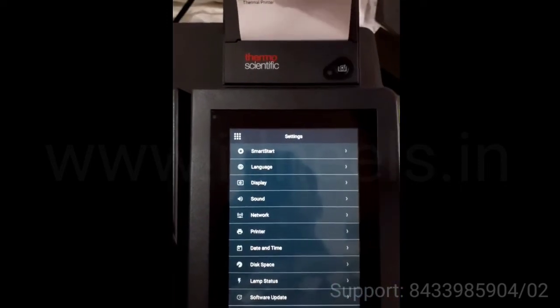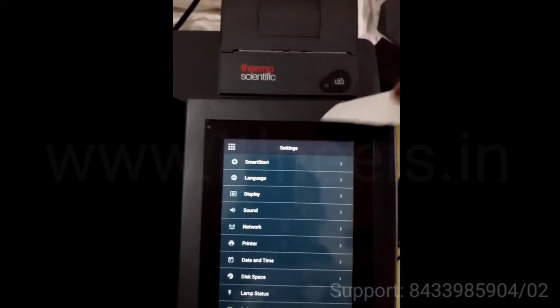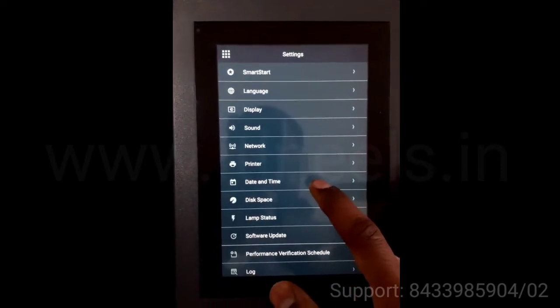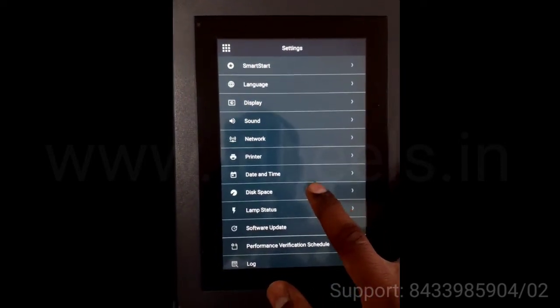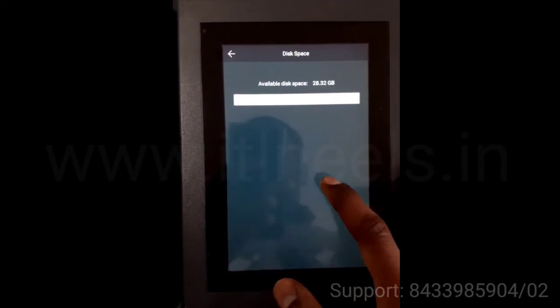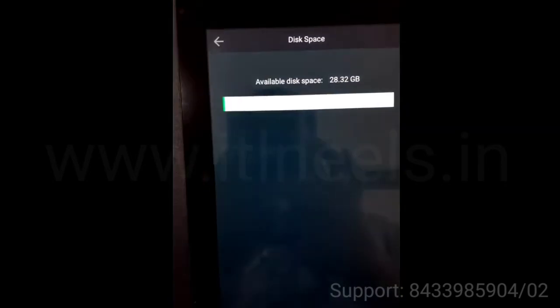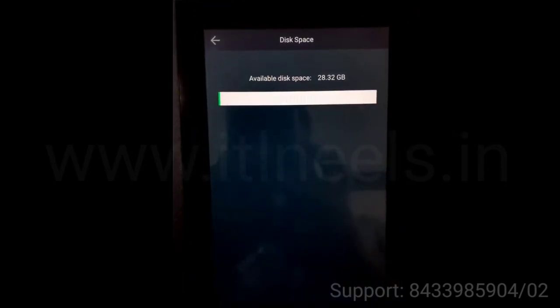You can configure the printer. You can change the date and time and see how much data or space is available.